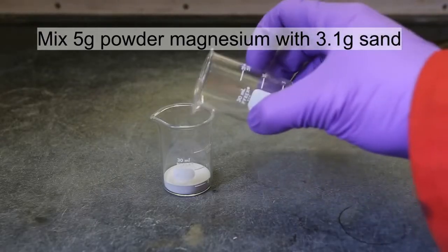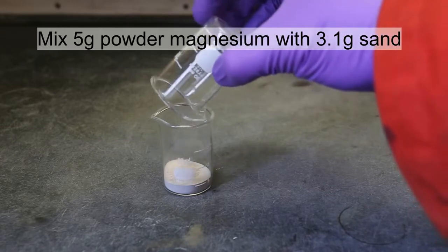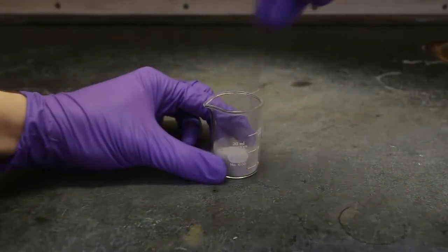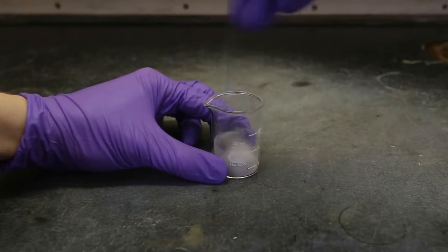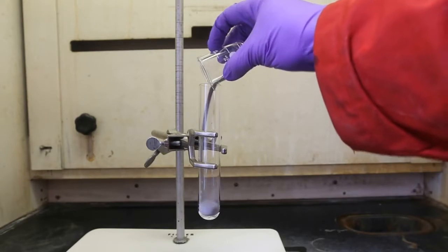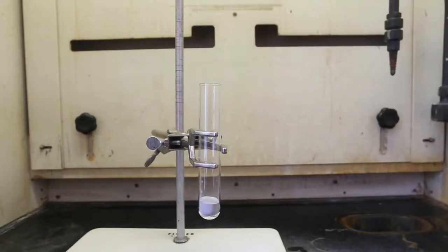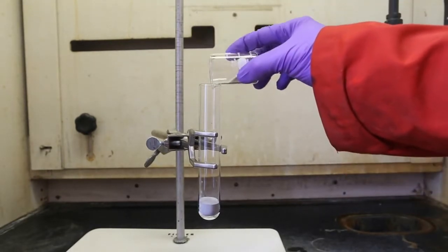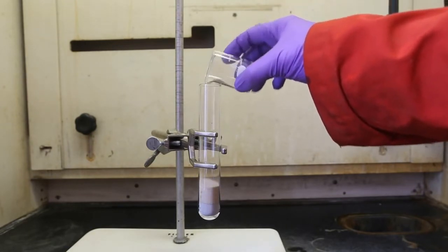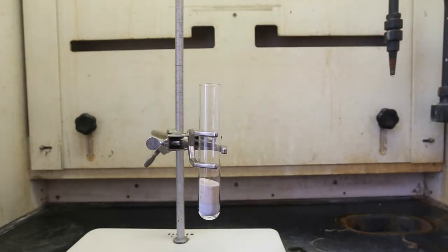First, mix about 3.1 grams of sand with about 5 grams of magnesium powder. Then, using something like a glass rod, mix the sand and the magnesium powder together thoroughly. Next, add the mixture to a test tube. Then, add about an equal amount of sand on top of the magnesium sand mixture. This is optional and should not be done if extremely fine sand is used.